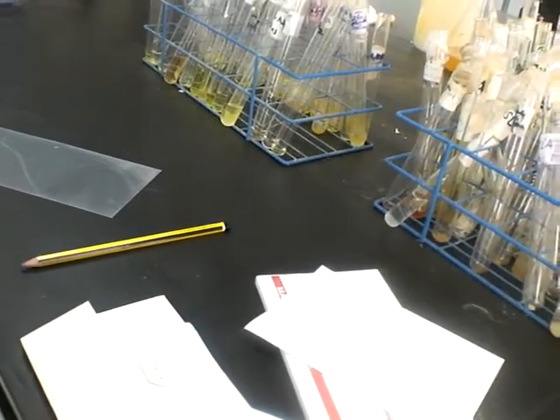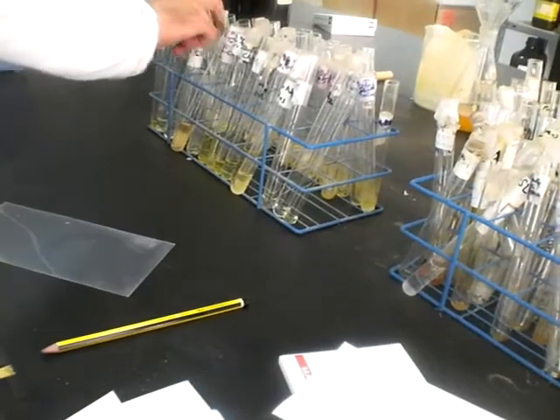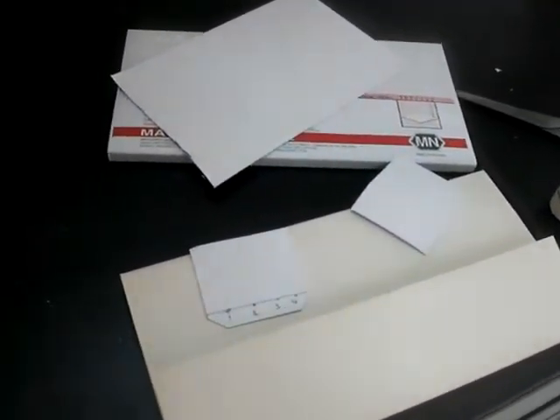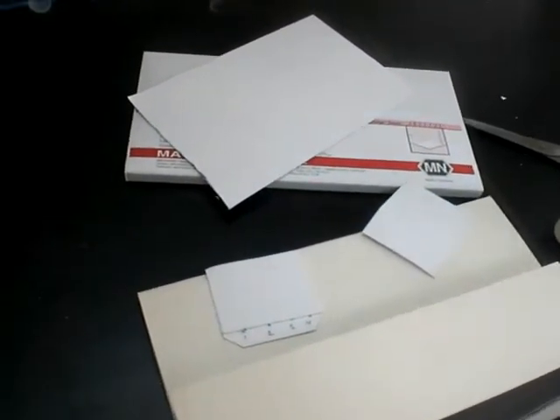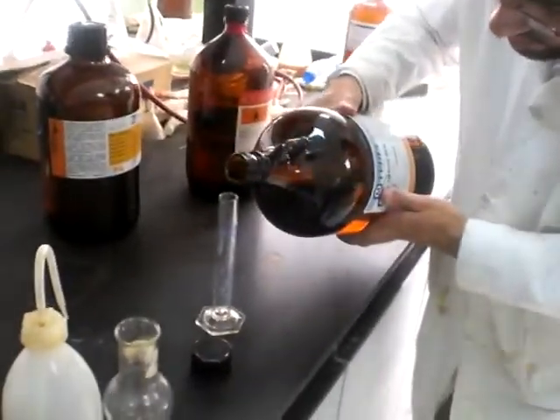We add two spots from the solution, one concentrated, one diluted. This depends on the opinion of the analyst. So the idea is just to know if we have a new spot from the reaction solution or not. Once we have a new spot, this means most probably we got a new compound and this is the product. Here we will prepare the mobile phase.